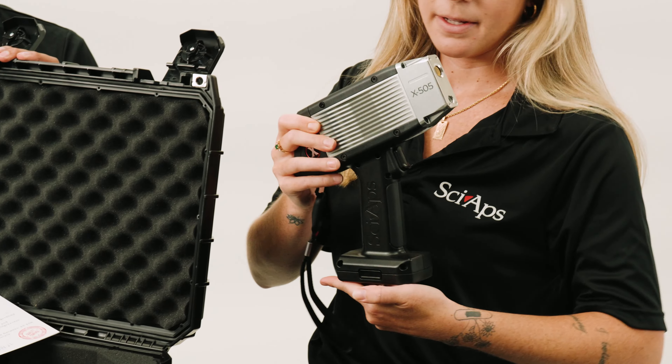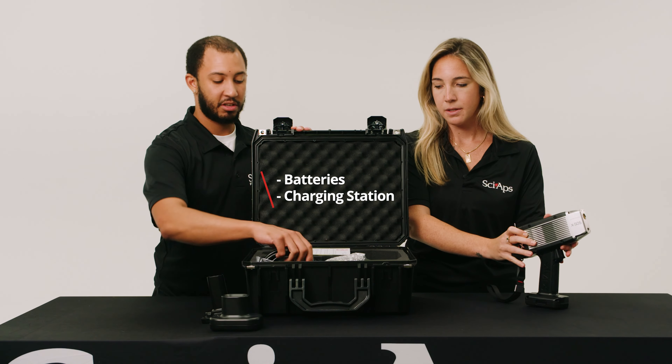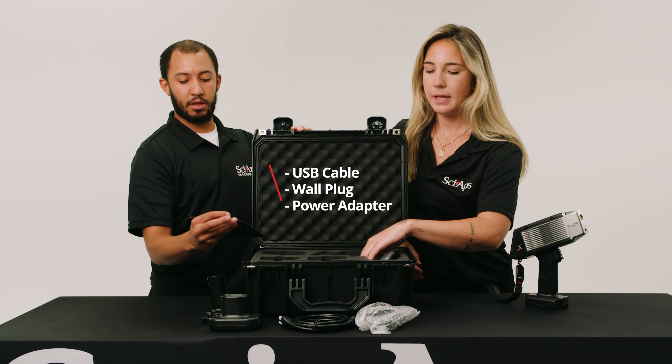It comes with two batteries — pop one in and turn it on. Along with the batteries you'll get a charging station, a USB cable, the wall charger, and an AC adapter.